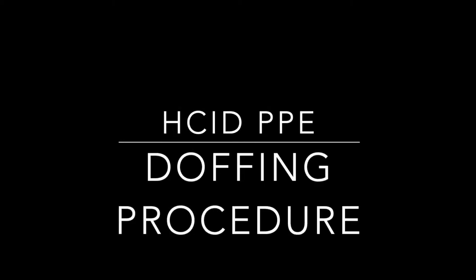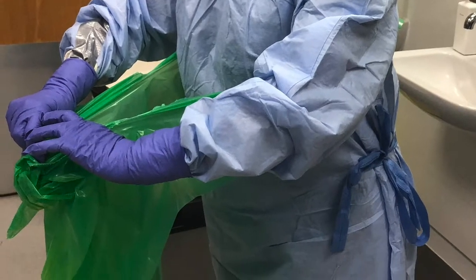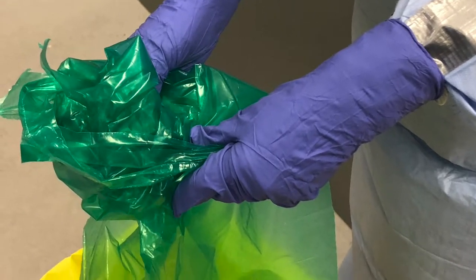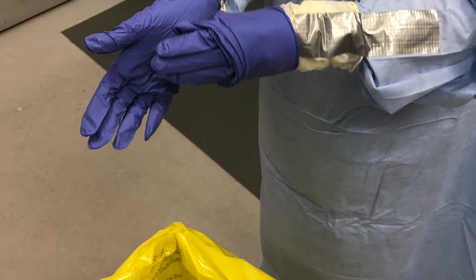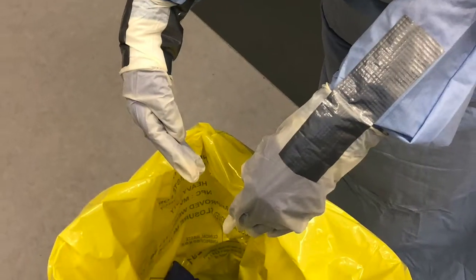HCID Personal Protective Equipment Doffing Procedure. Whilst still in the patient's room — Red Zone — standing over a bio-waste bin, take the apron, pulling down and away from the body, rolling it into the bin. Remove the outer pair of gloves, placing them into the bin, being careful not to touch the outside of the gloves.